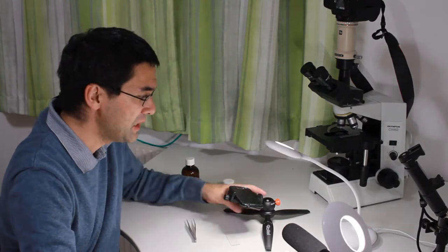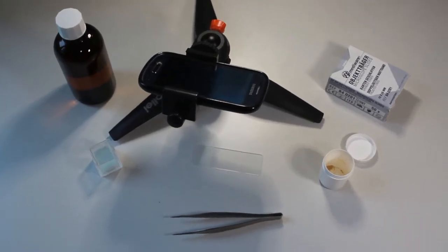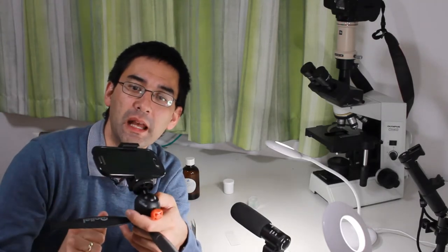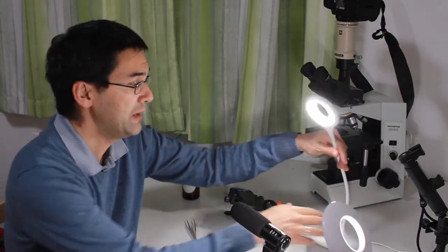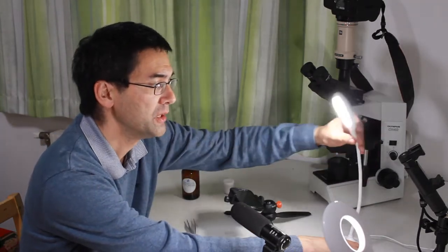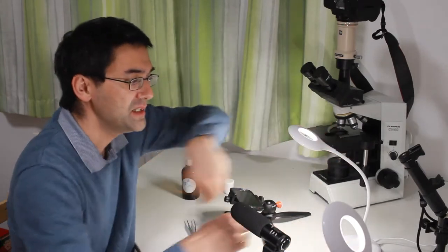And then for actually making the videos, I'm using a mobile phone camera, which I mounted to a small tripod. The advantage of this is that I can get a macro image of the slide. So I move it forward a little bit, and I can move quite closely to the slide. Because there is also a built-in LED lamp, this ensures that I have very good illumination. But light is very important, and for this reason, I also have two of these desk lamps. They have a flexible neck, and this allows me to position the light quite precisely, and I can make sure that the light intensity is just right.